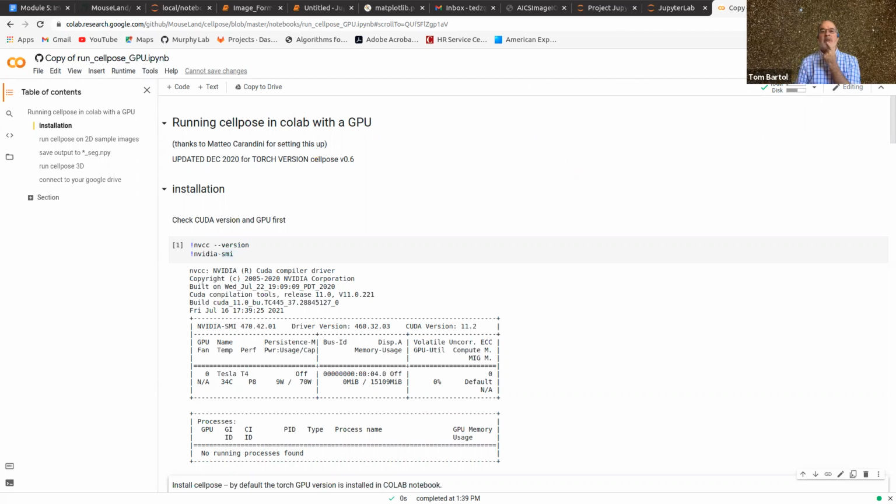So Ted, would it be possible to segment just a single instance of a cell and make a cell shape from those single images? Not a learned shape, but just a reconstructed shape, and output that as an SBML spatial file. Yeah, I think you could probably do that. Because of course you need the 3D confocal slices, the optical sections in 3D, of course. Right.